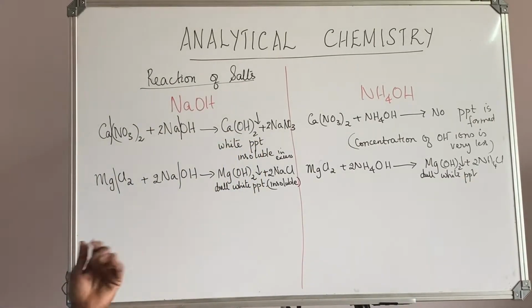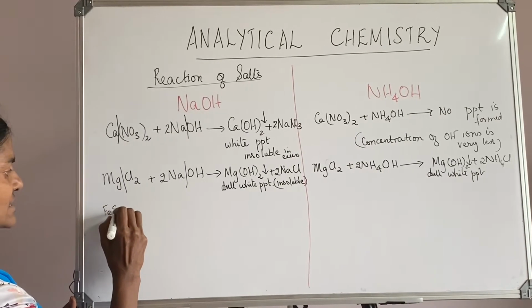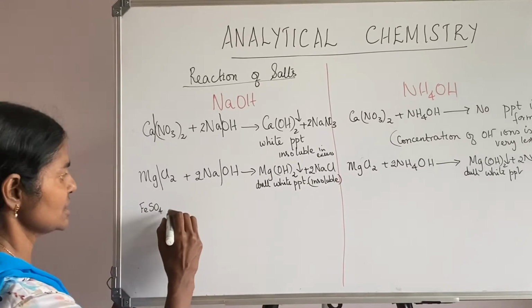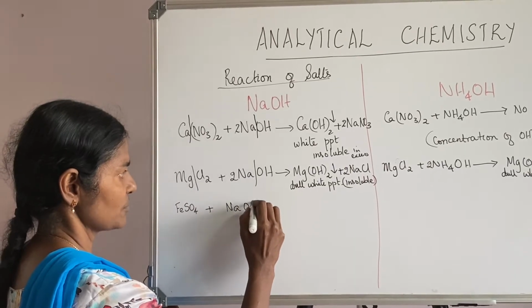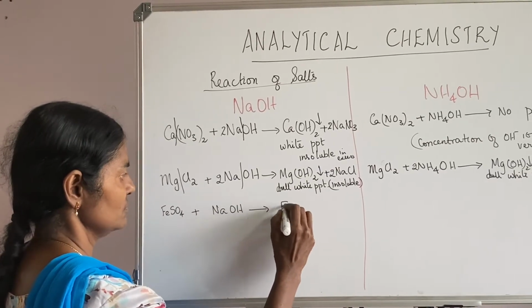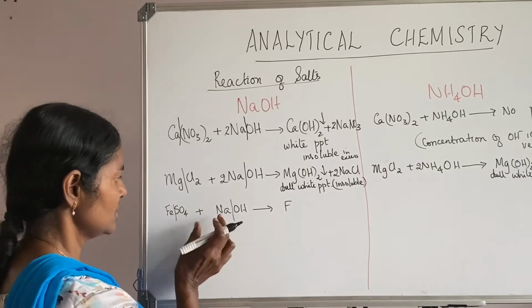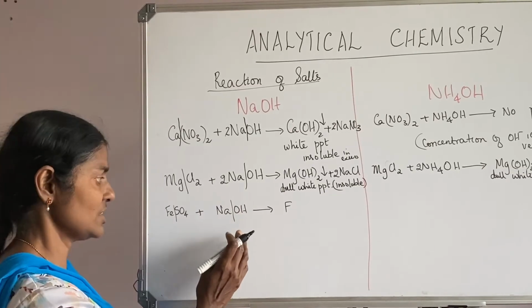Okay, so that's over. Now we move on to ferrous sulphate. What happens to ferrous sulphate? This ferrous sulphate also reacts with sodium hydroxide to give, again you break it down like this. So what is possible? Sodium and sulphate combine to give you sodium sulphate.